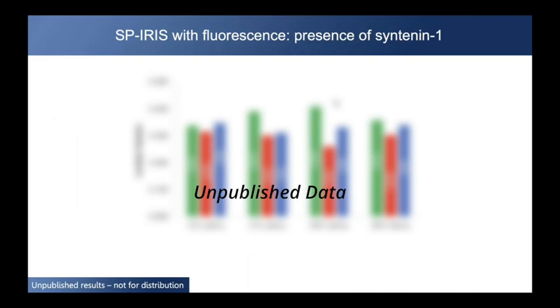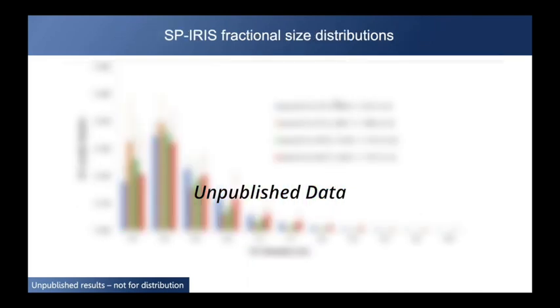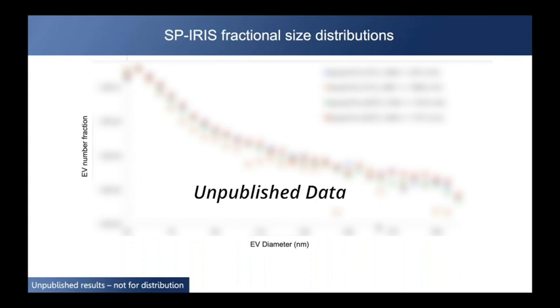So what does SP-IRIS tell us about the size distribution that we can get from the label-free measurements? These results show that the size distributions for apical versus basal release in both control and rotenone conditions are not too different. There's a peak around 50 to 55 nanometers, and the distribution falls off rapidly as we get to a diameter of about 100 nanometers. We can also plot this as we would the Spectradyne results. And this shows us again that these distributions are quite similar across all four measurements. They're a little more scattered in the basal release and the control conditions, which could be experimental, as well as sample preparation.